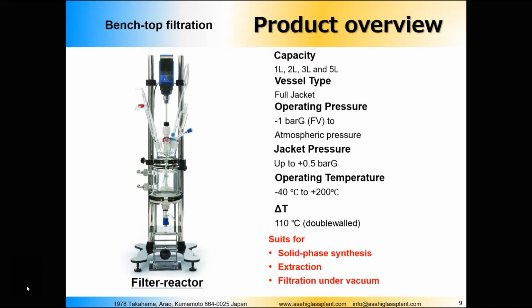So what kind of problem will we have then? We have the filter that separates the upper part, where we have most of the reaction mixture, and the lower part, which doesn't have a zero dead space volume due to some grooves that we have in this PTFE filter bottom.